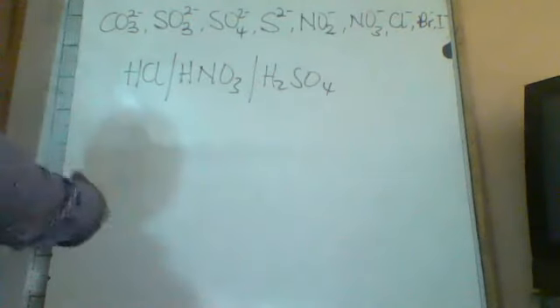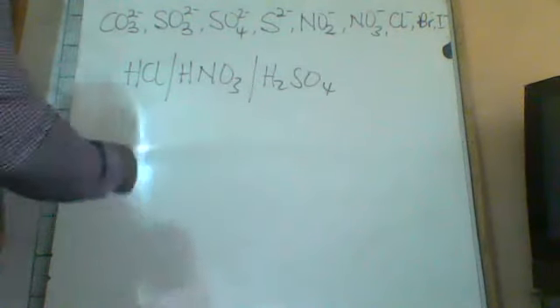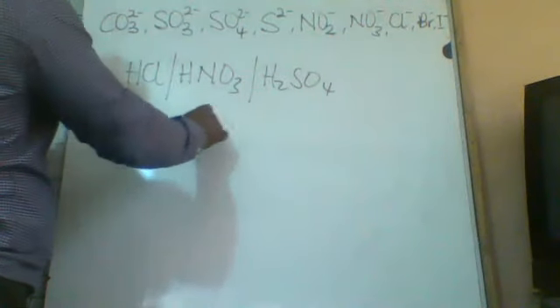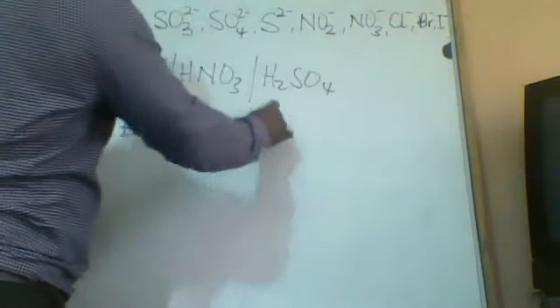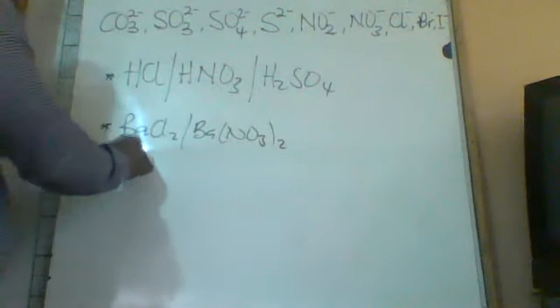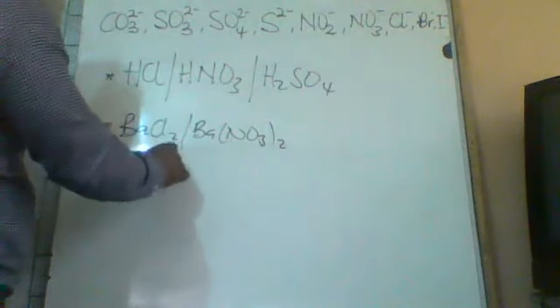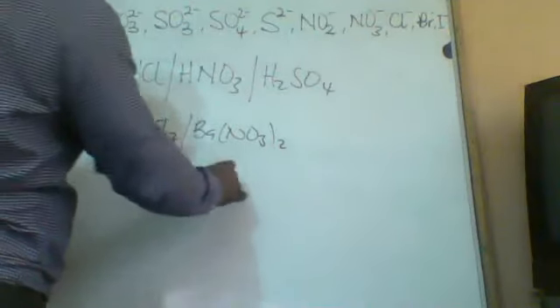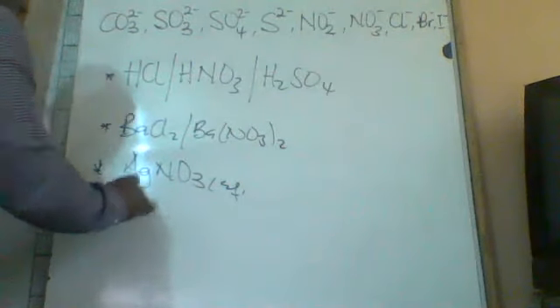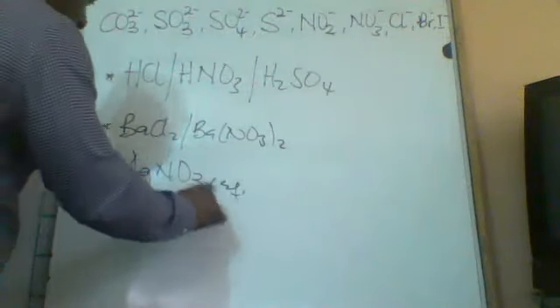Other reagents that can be used include barium chloride or barium nitrate. We can also use silver nitrate solution. All these are in solution form. And sometimes lead nitrate.